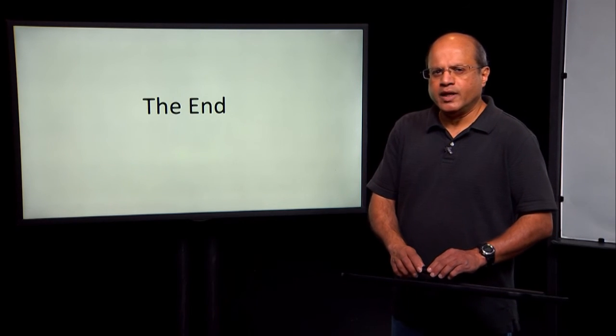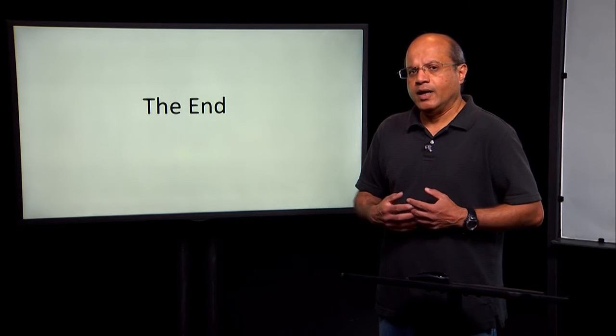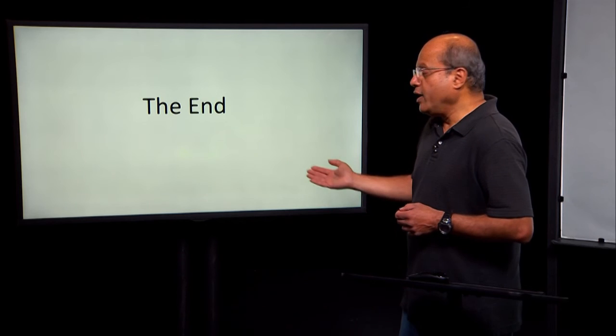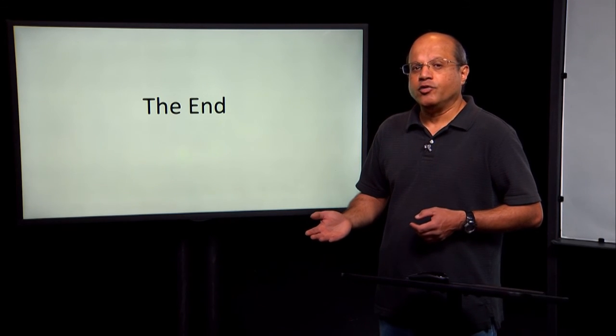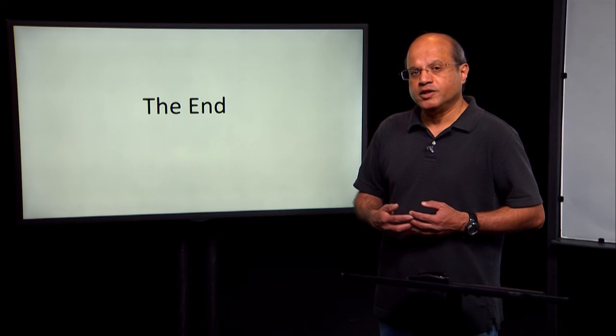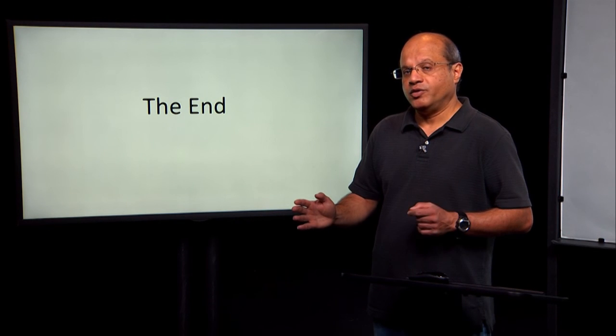Okay, so that's all we need to know about the forward modeling part of CryoEM. In the next lecture, we're going to take that description of the forward model and then try to figure out how we can infer the structure S from this forward model given images I1 through Ik.